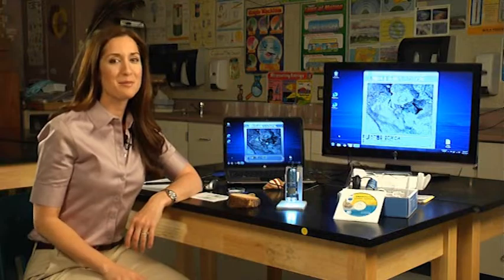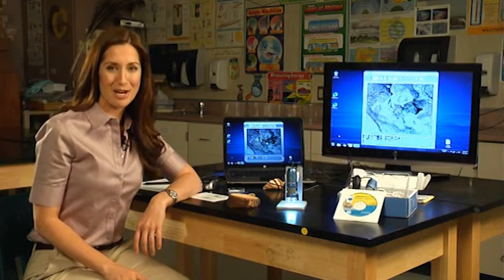The SmartScope 5M is fun, it's easy to use, and most importantly, it gets students excited about learning.